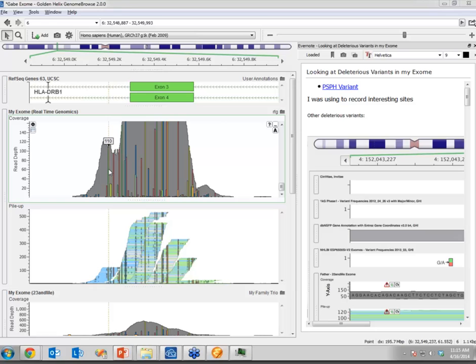Another thing NIST is doing, by the way, with the Genome in a Bottle, this is sort of just one front of it, is they're trying to help define these types of things in terms of giving you a truth set to benchmark against, giving you the actual samples. You can go buy NA12878 and run your own gene panel against that and test against the truth set. So these are all sort of within the same camp of trying to make this data ready for putting into a clinical pipeline. And it's not about every single situation being perfect. It's just knowing what the strengths and weaknesses are.